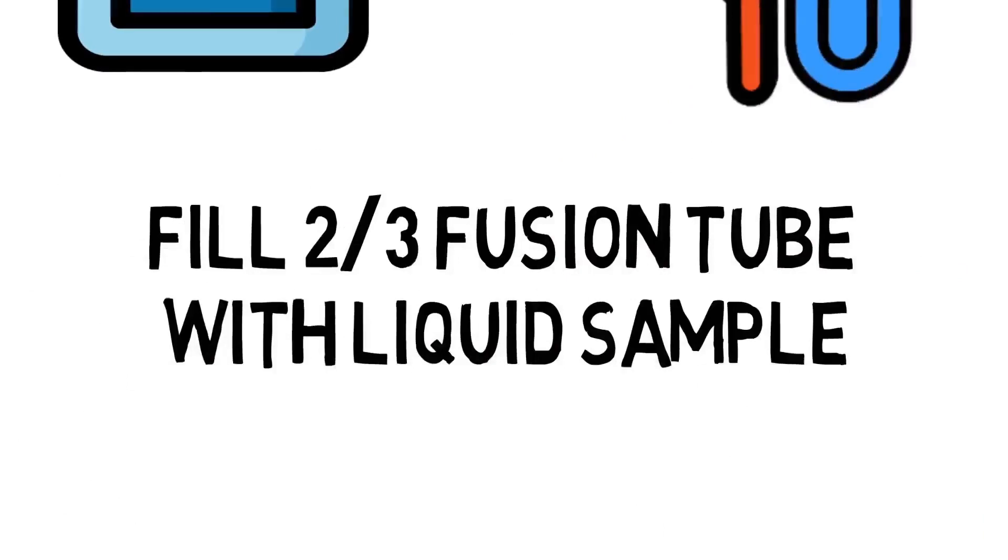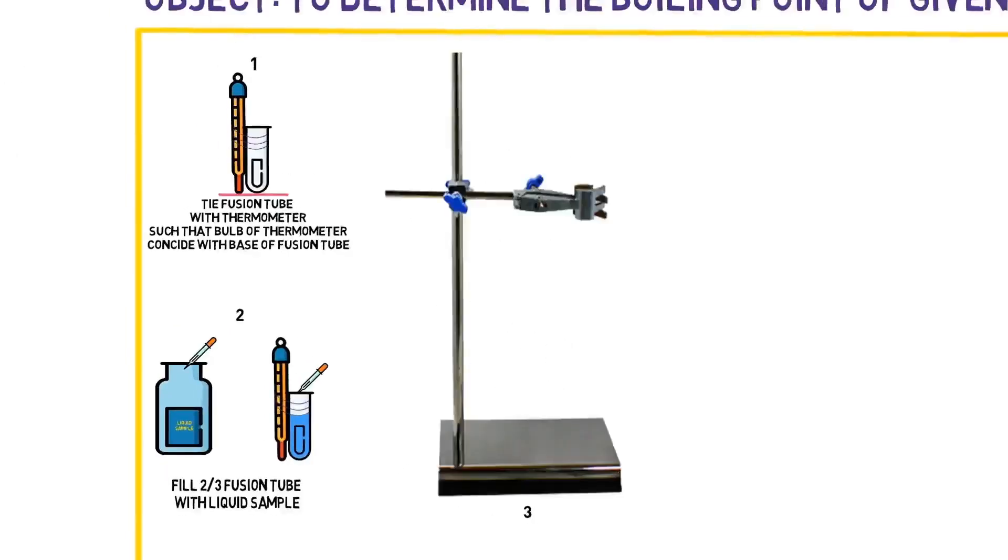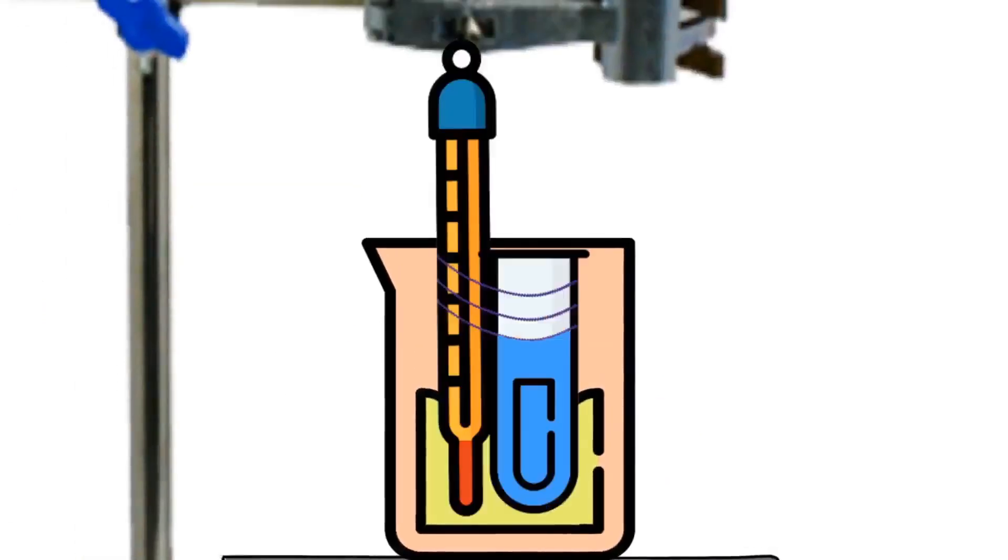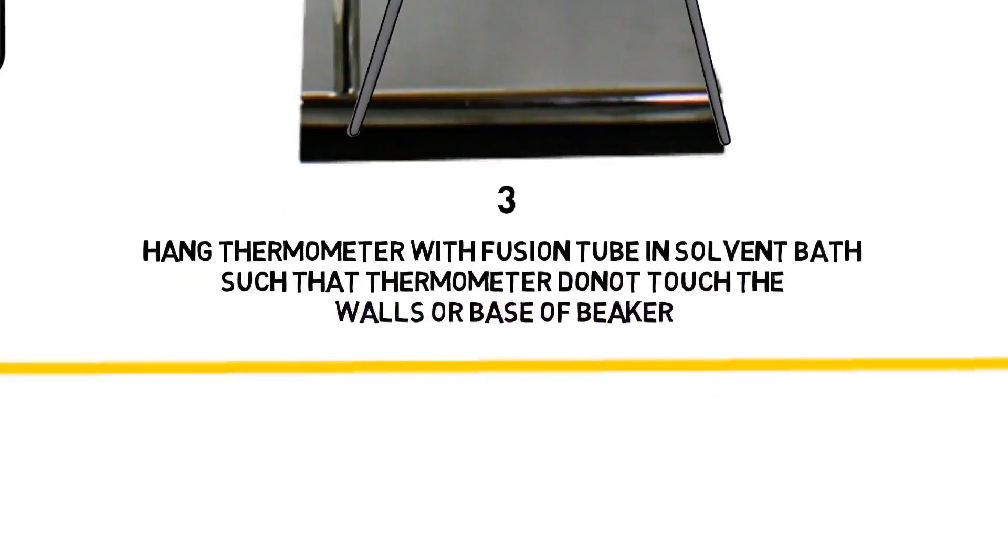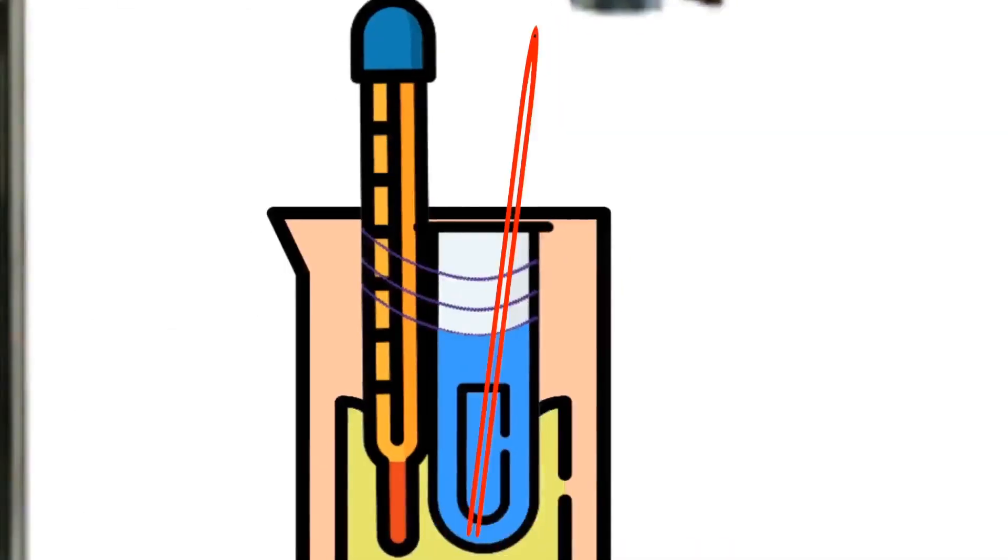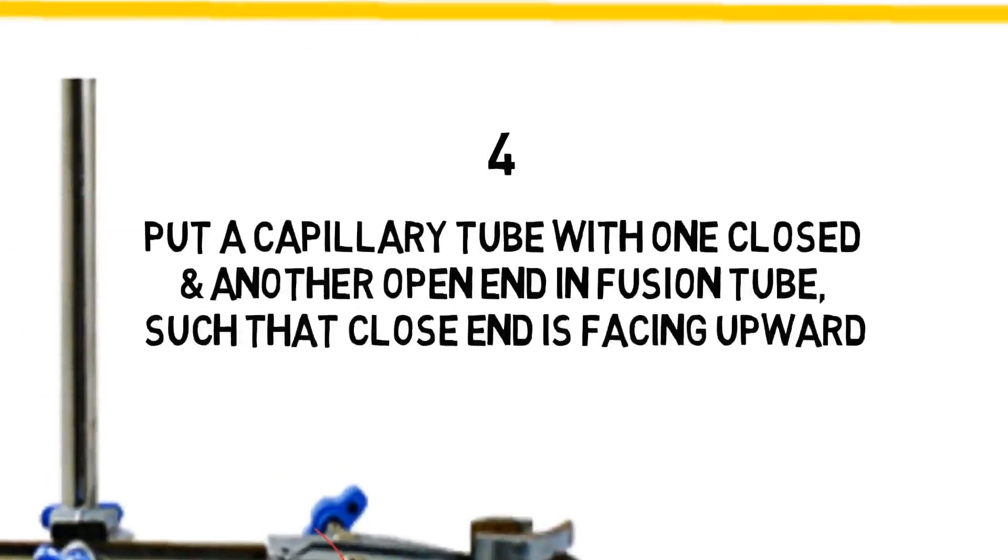Fill two-third of fusion tube with liquid sample. Hang thermometer with fusion tube in solvent bath such that thermometer doesn't touch walls or base of beaker. Put capillary tube in fusion tube such that close end is facing upwards.